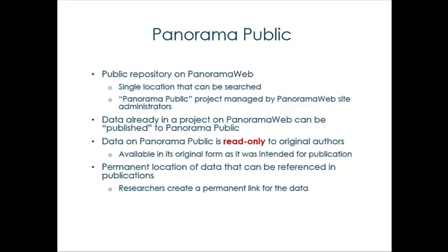And this is basically just a project on Panorama Web that's administered by the site admins. Having all this data in a single location is great because it lets us create a searchable catalog of all this data in one place. So if your data is already on Panorama Web in a project, it can very easily be published to Panorama Public, and this becomes a permanent resting place for the data, where it continues to remain available in the original form as it was intended for publication.